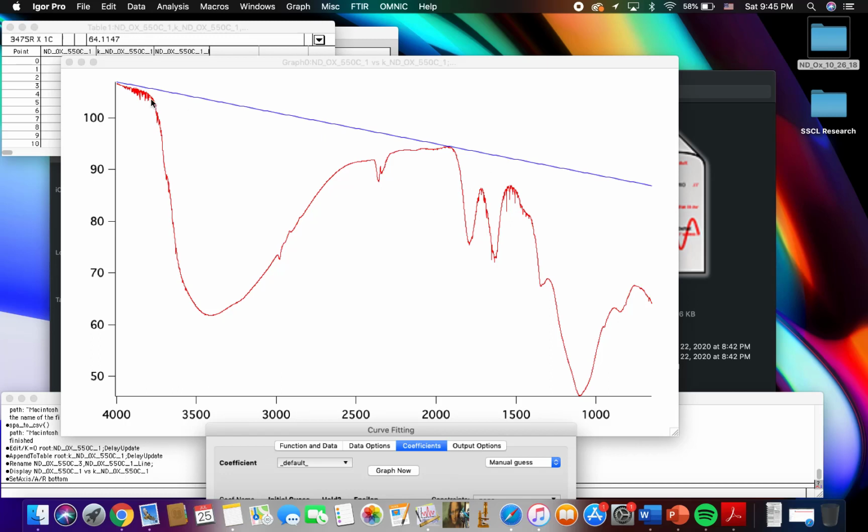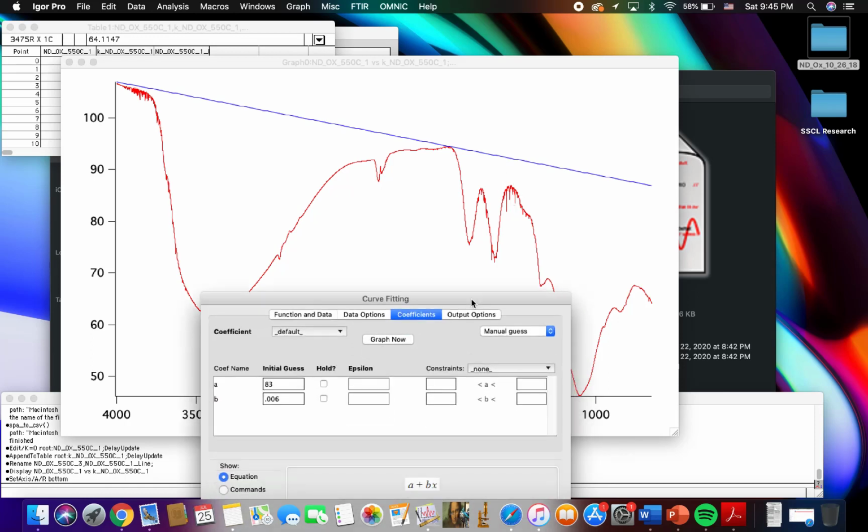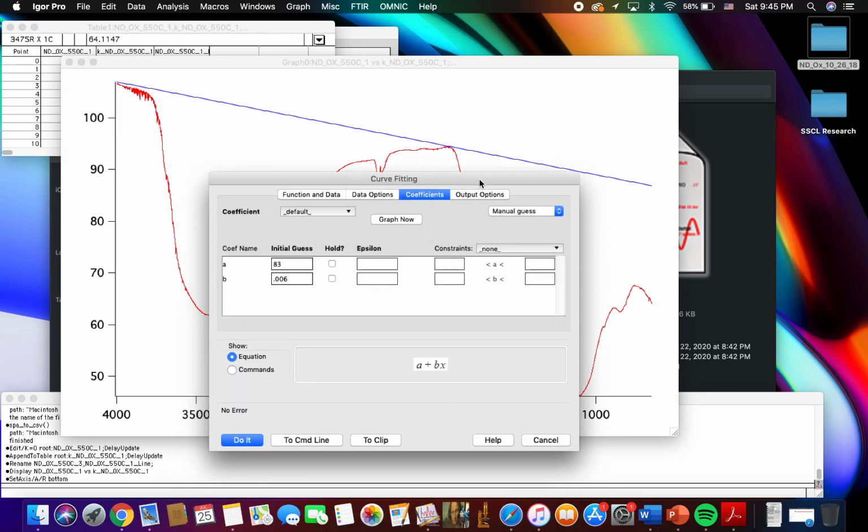The reason why I did the 4,000 on this one is because this is too far down. If I was to connect this point and this point, the slope will come all the way and it'll pass the 4,000 number and it'll be way up here, which is just way too far. So this is a good one, it's close to this one and it's still not too far off of this one. So when you are collecting more KM transforms, you can adjust these and start seeing how the graph is affected when you change this line. But pretty much we're going to work off of this.